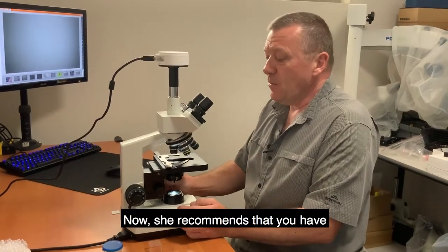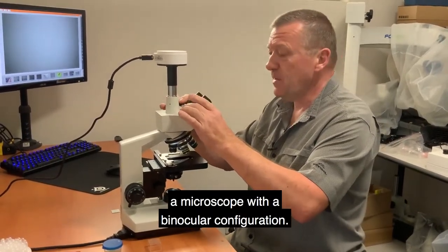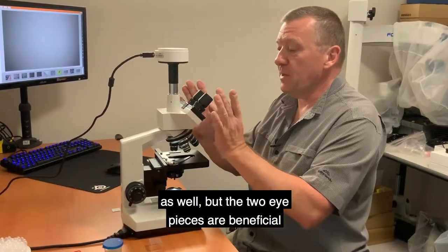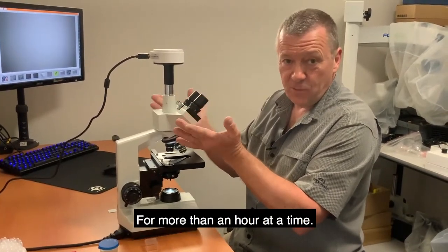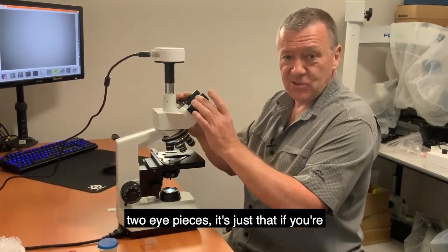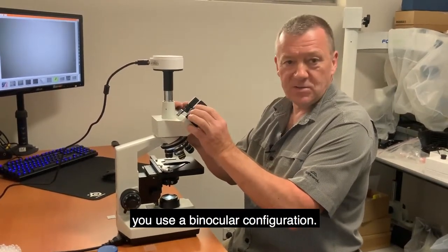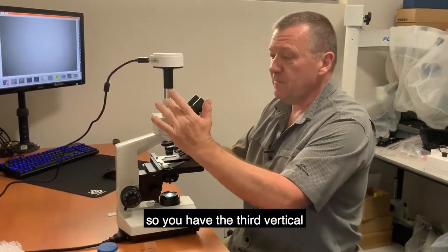Dr. Ingham recommends a binocular configuration — that's two eyepieces. You can get a microscope with a single eyepiece as well, but two eyepieces are beneficial mainly if you're using the microscope for extended periods of time, more than an hour. You can see the same thing through a single eyepiece, but for extended use you'll get headaches and eye strain. That's why the binocular configuration is recommended. This microscope is actually a trinocular.